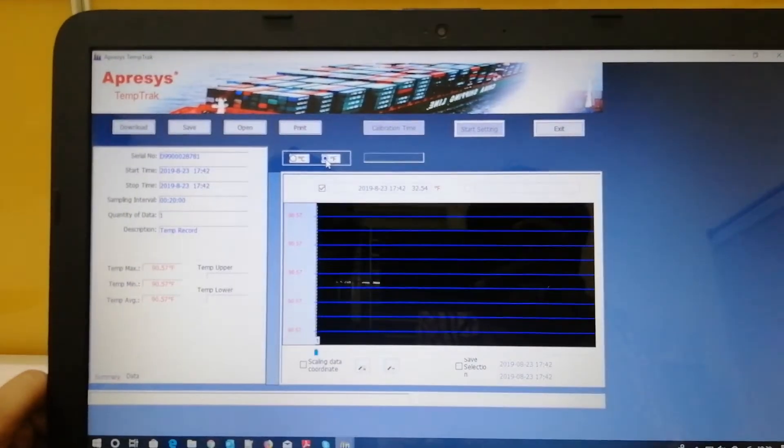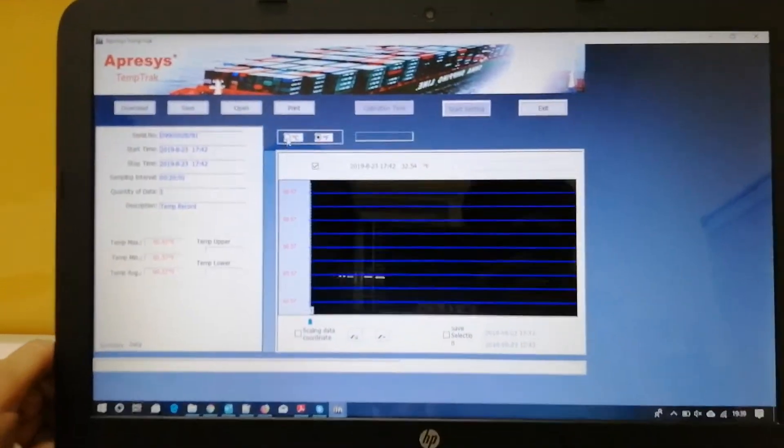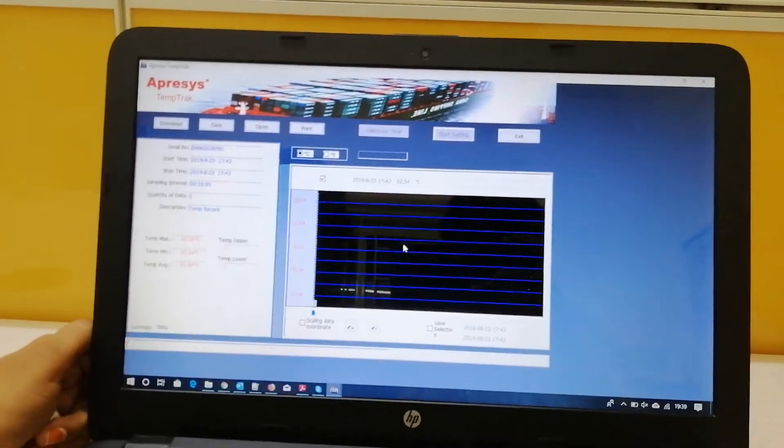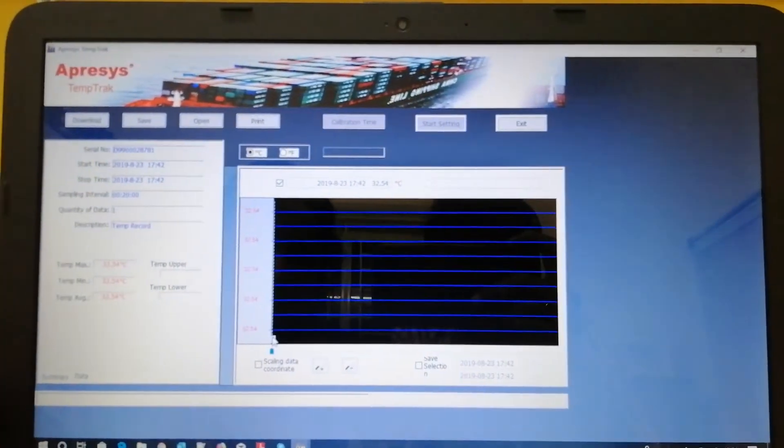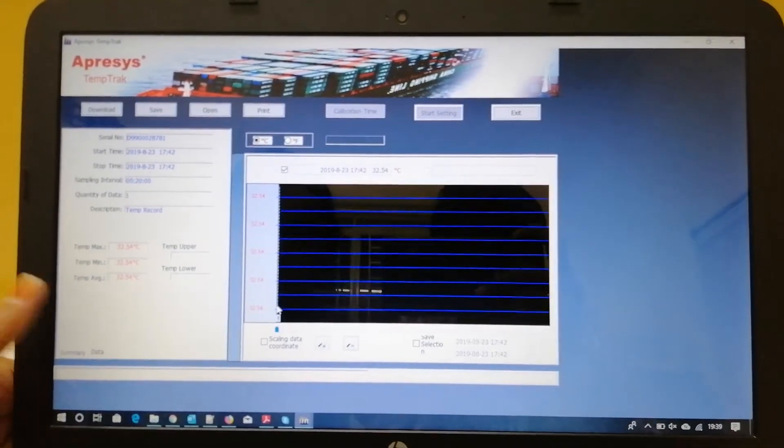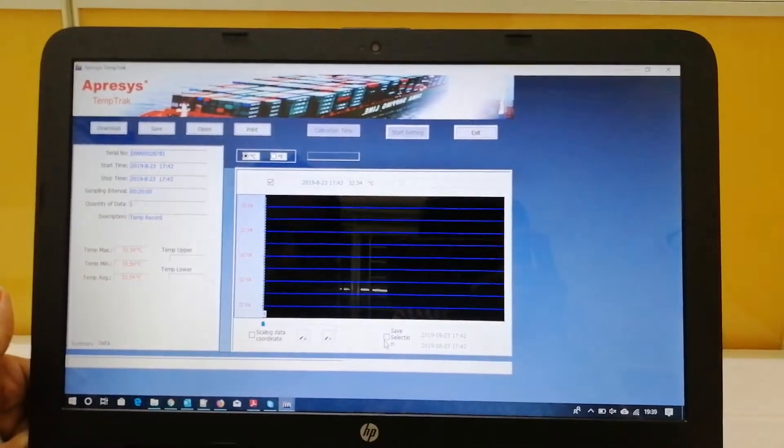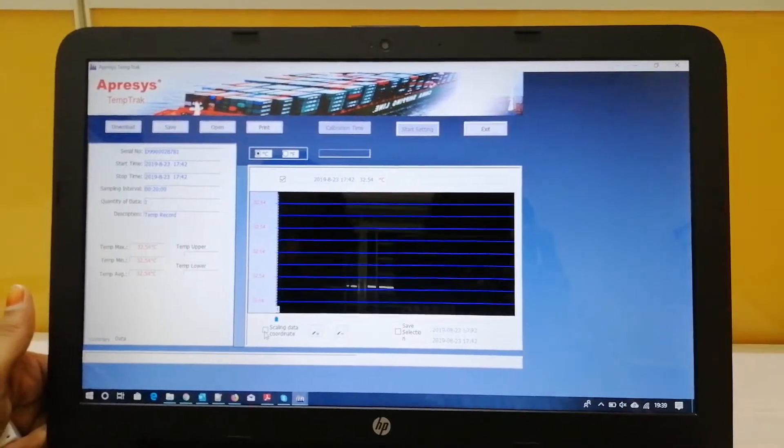As I mentioned, it can also measure in degrees Fahrenheit. Here you can change the units and see the data in graphical form. This is sample data, and you can change the scale based on your requirement.